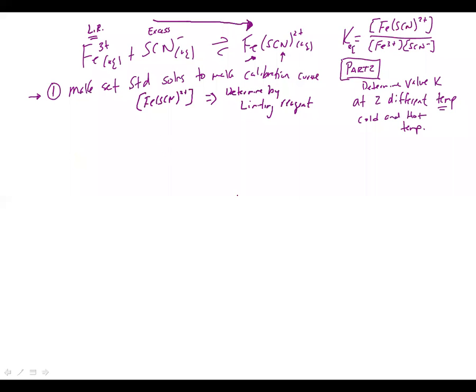Because of the way it was set up, once you do the first part of this experiment, you will have the concentration of your product based on the limiting reagent. You will also have some absorbance values for, I forget how many test tubes, maybe 5, maybe 6, maybe more. So you'll have a bunch of absorbance values that correspond to concentrations in each of those test tubes.